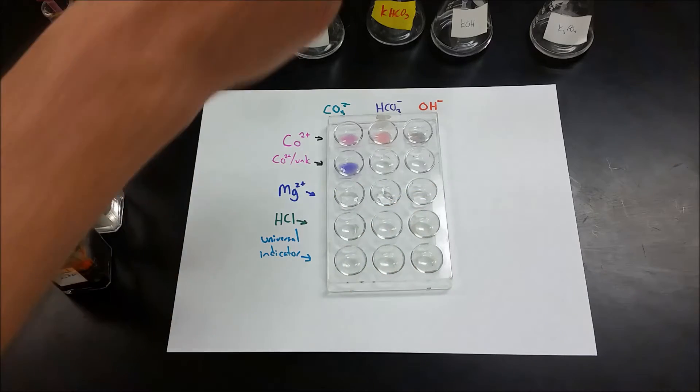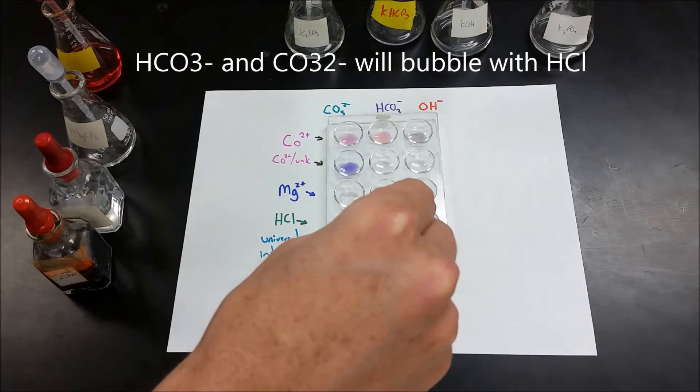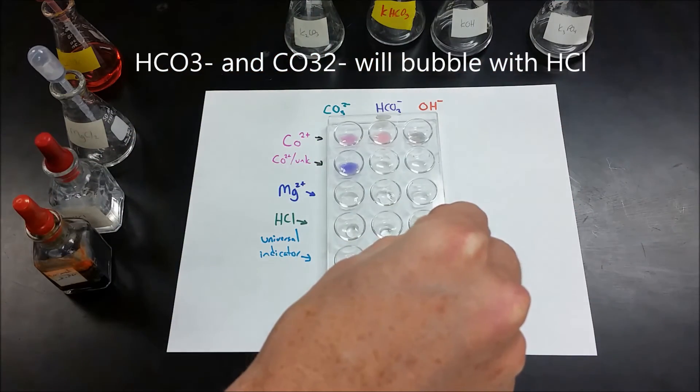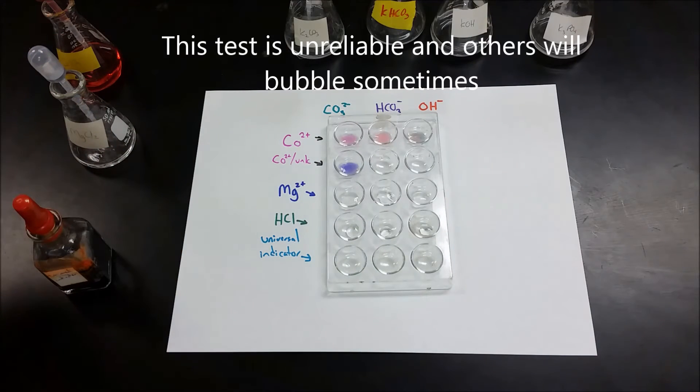The next test you can do is you can go ahead and take all three and add hydrochloric acid to them. This one is very unreliable, but it's a good test as kind of a confirmation that you definitely have one of these. The carbonate and bicarbonate will form bubbles when you add hydrochloric acid.